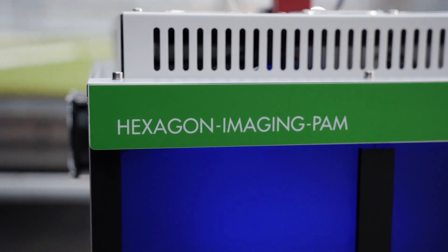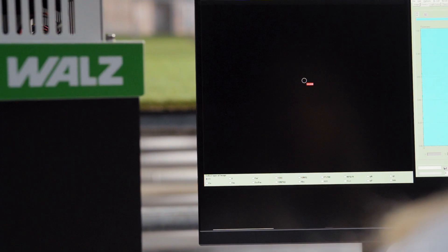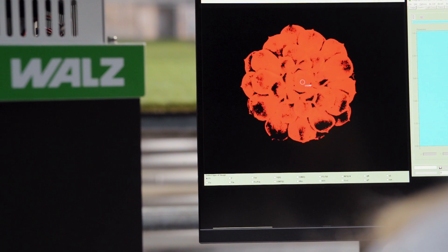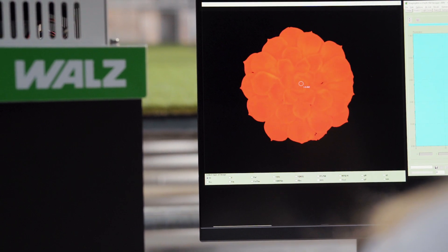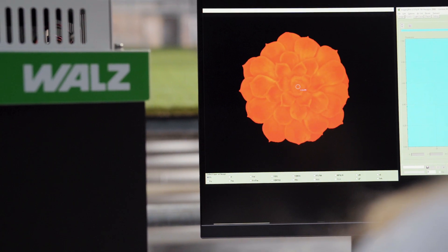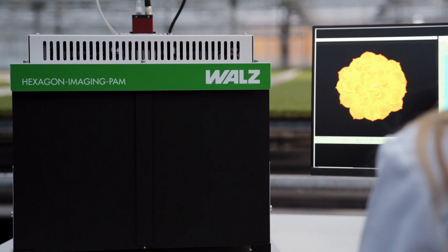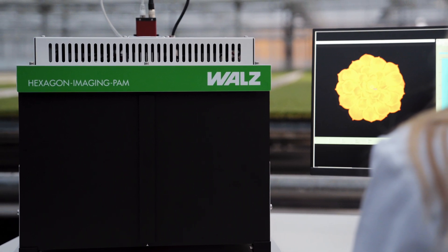It has been successfully demonstrated that Photosystem II fluorescence can be used for optimizing growth parameters, detecting plant diseases, determining resilience in a changing environment, and more.